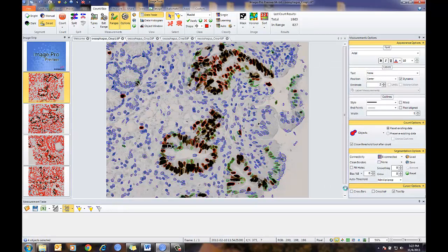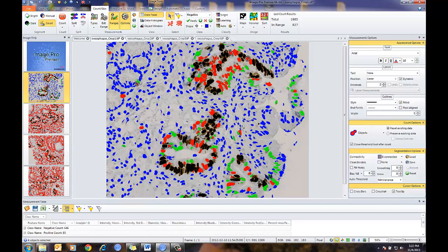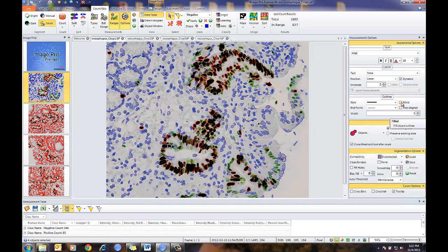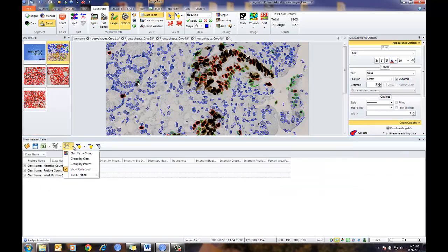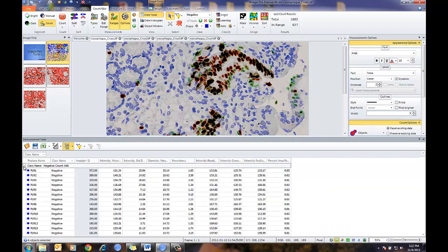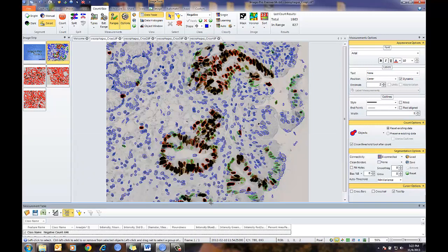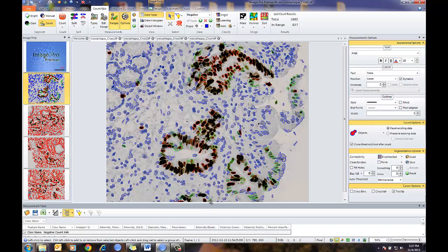Pressing OK will now classify and color-code all of my previously found objects. Again, this is just building a training set — I'm selecting my nuclei. I'm going to show filled so you can see how it's color-coding them. What's also nice is that because I've classified these now, my measurements table has actually updated. I have grouping turned on — grouping by class — and it's now showing each group and how many objects or nuclei are falling into each category.